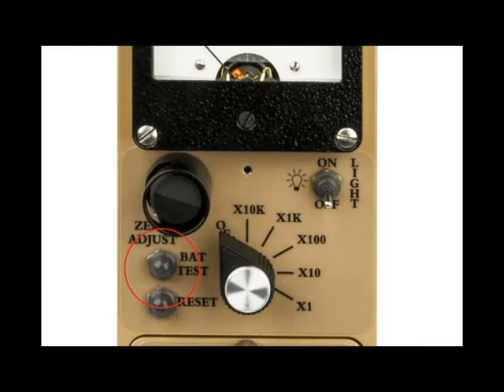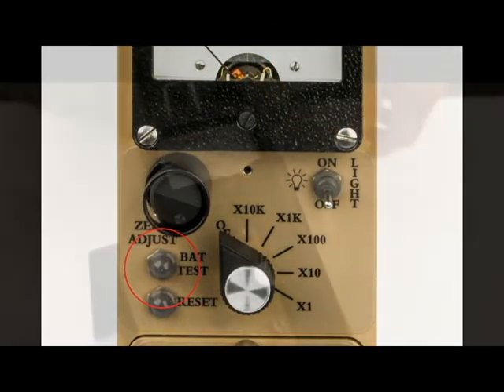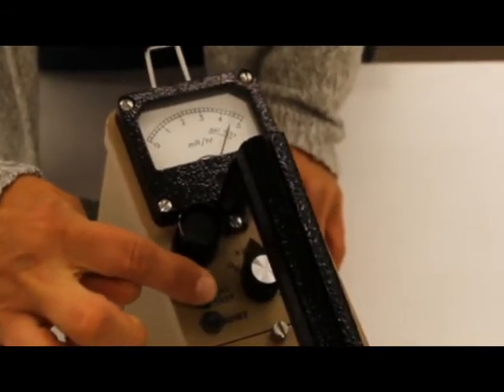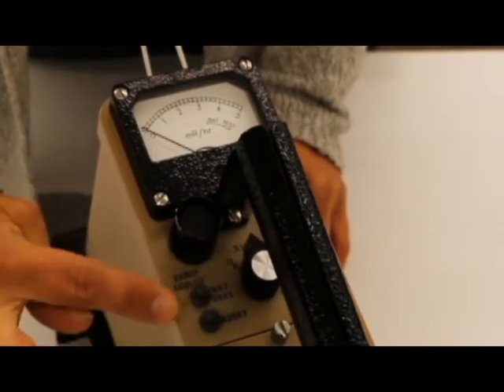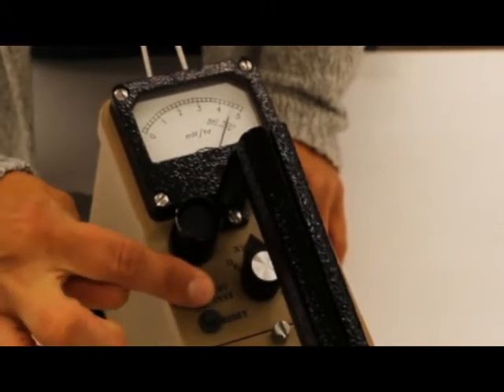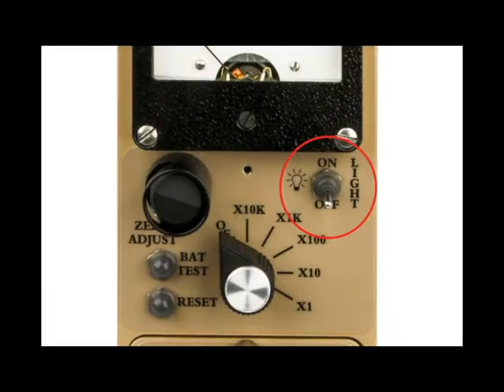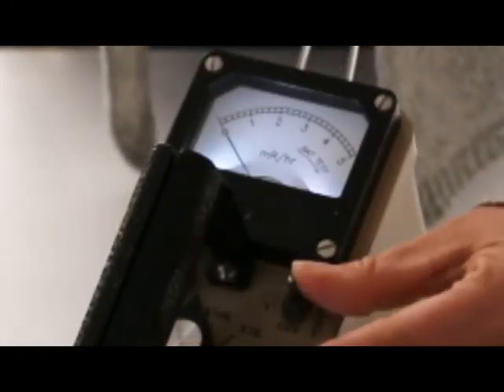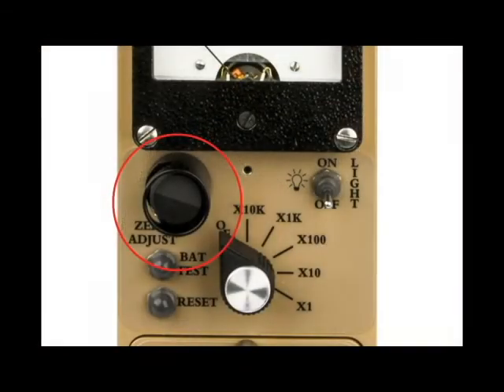The BAT test button is used to check the status of the batteries. The meter should read within the BAT test scale on the meter, and the range switch may be in any position except off for the battery test. The light toggle switch turns the LED light on the meter off and on. The zero adjust knob is a full one-turn control that allows for compensation of electrometer drift.